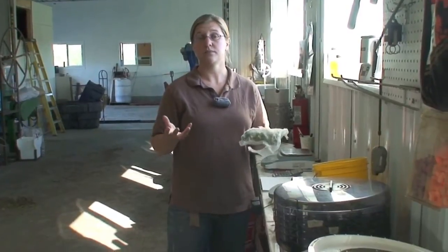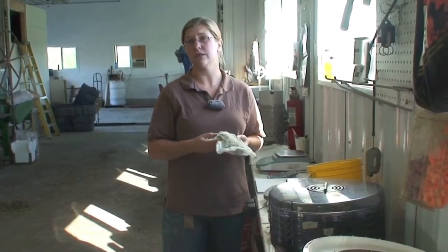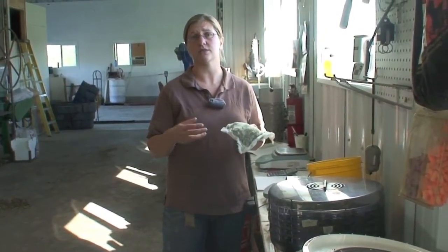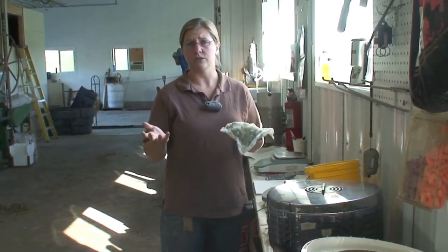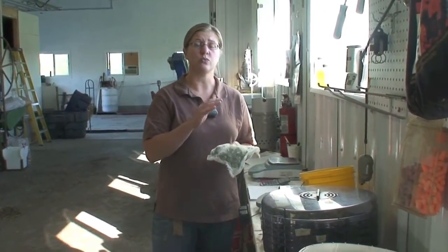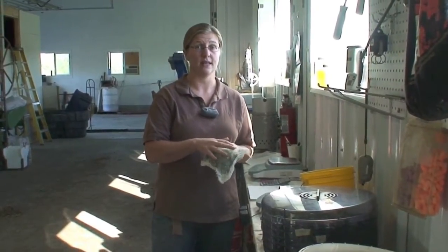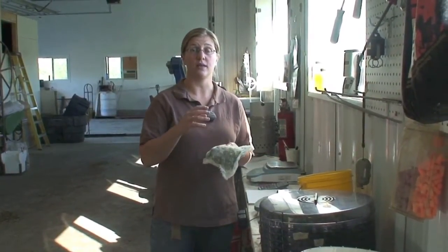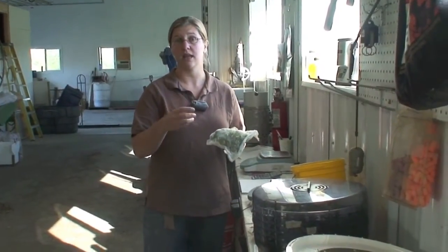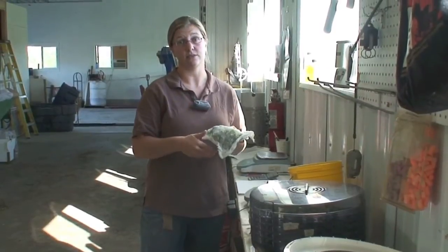So you harvest your hops and put them in the oast, but how do you know when they're dry enough? The best way is to take those hops and put them into a sample bag such as we have here. You want to make sure that you weigh the bag first, write down how much the bag weighs, then fill it up with freshly harvested green cones and write down their weight as well.